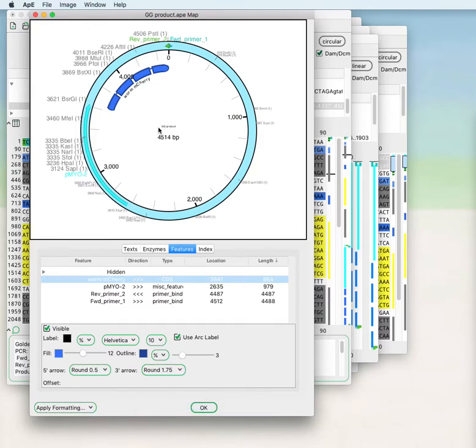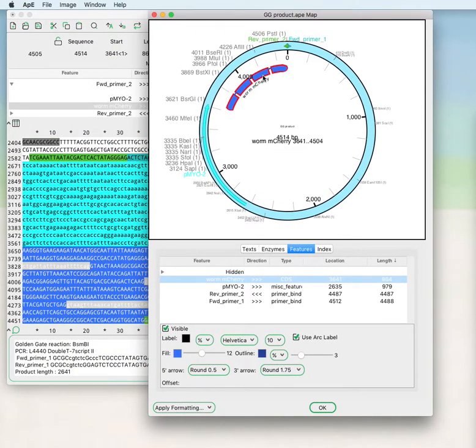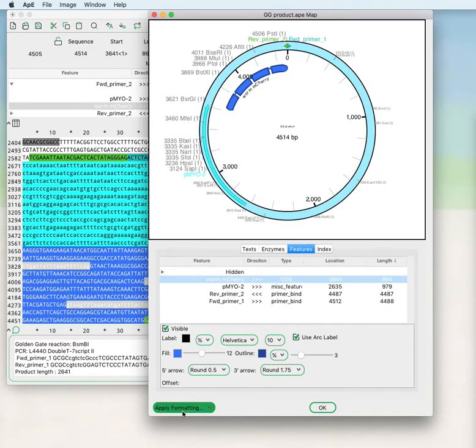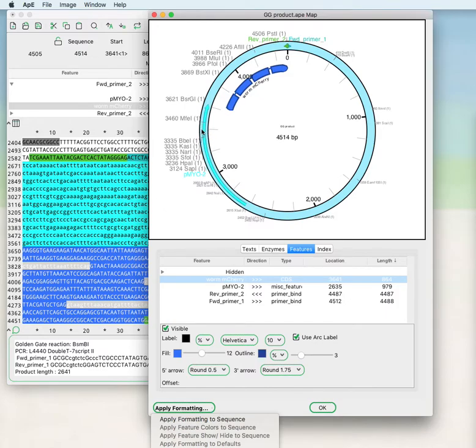So there's a lot of configuration options available. When you click on a feature, it will take you to that feature via a link. You can apply this formatting to the sequence, and that will save most of the formatting options back to the sequence. And so when you do the graphic map again, all of these formattings will be saved.